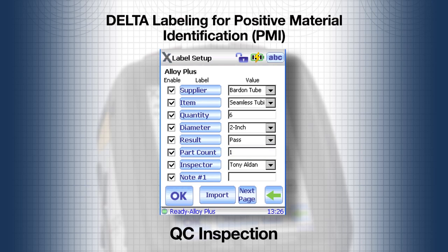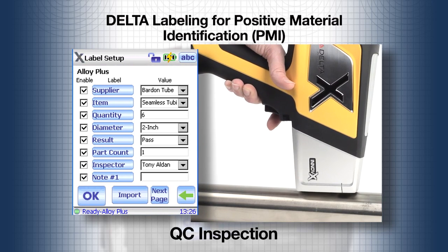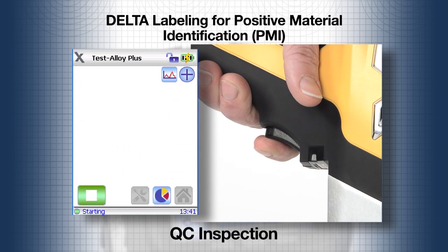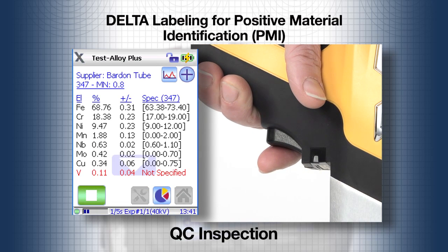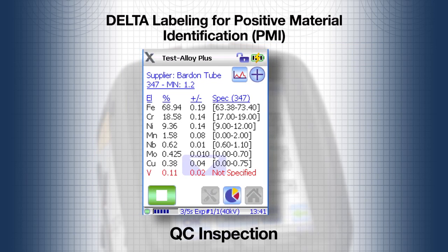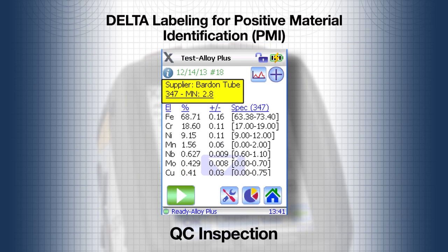Once the label options have been chosen, you can start testing right from the label screen. Place the analyzer on the tube, pull the trigger, and the test begins. The test result for the first tube is 347, the expected grade.